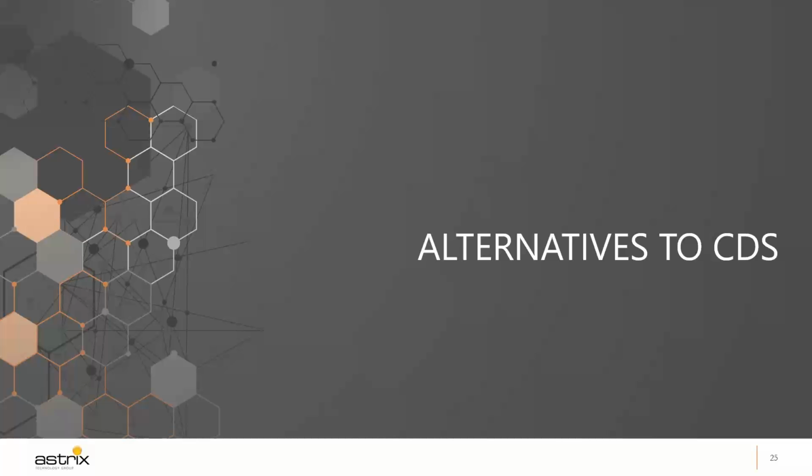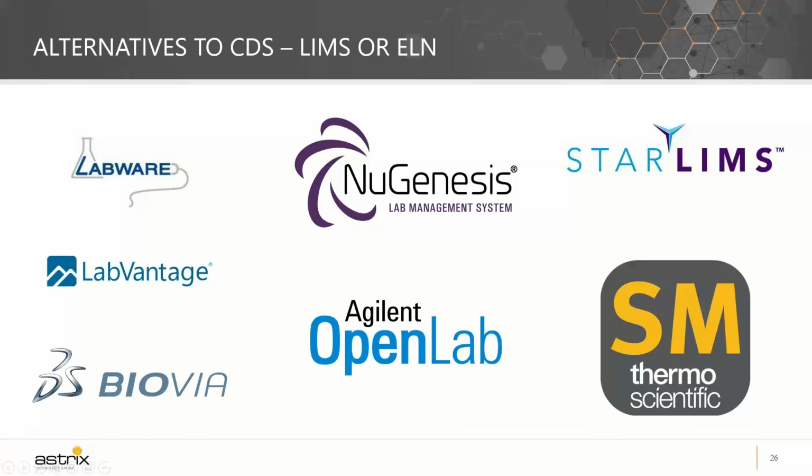But there are other alternatives to CDS, right? One of them, for example, is a LIMS or an ELN system. LIMS and ELN applications, if configured correctly, will generally have an audit trail capability for most analyst actions, and have the capability to perform calculations that are problematic for chromatographic applications, such as the multi-sample set calculations mentioned before.